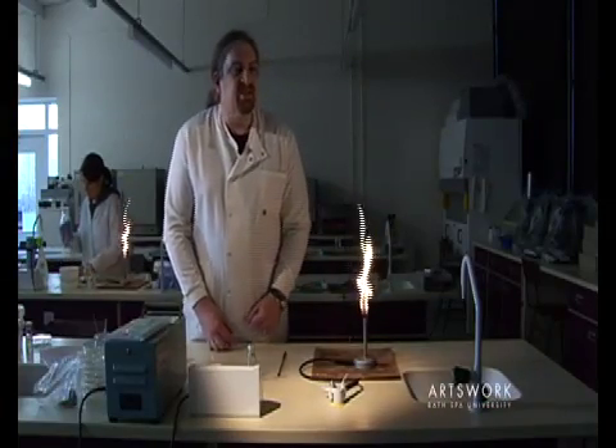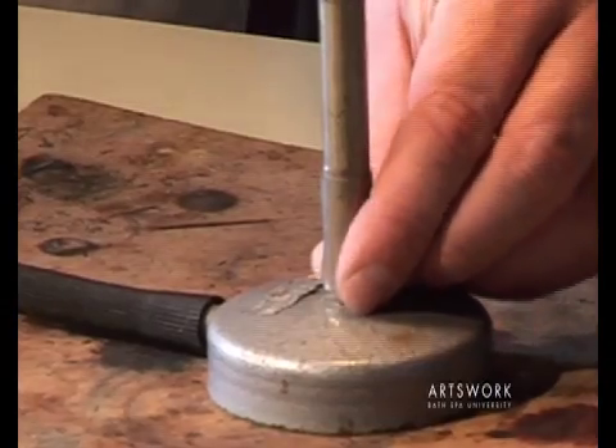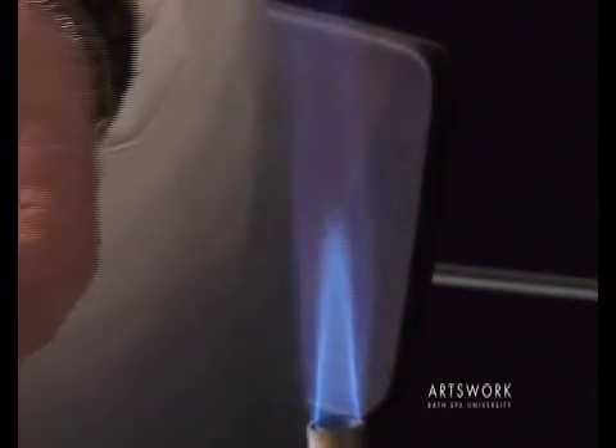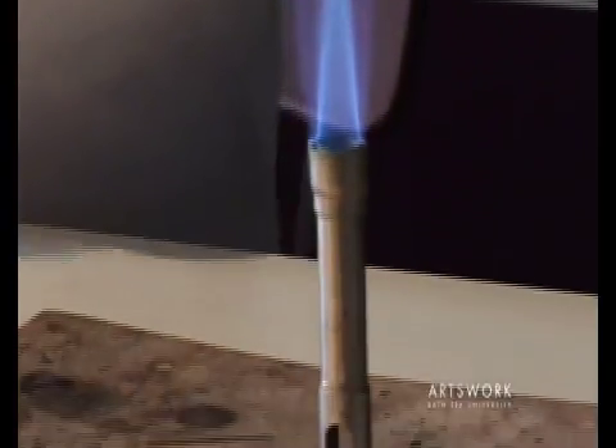When we want to use the Bunsen for sterilising equipment, turn the metal collar at the base to open up the air hole for a much higher rate of airflow, resulting in this much hotter but blue, almost invisible flame.